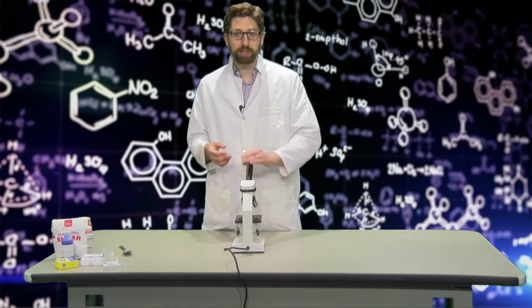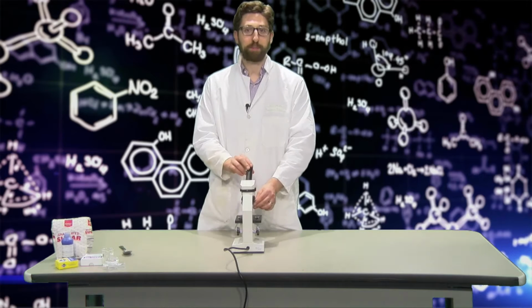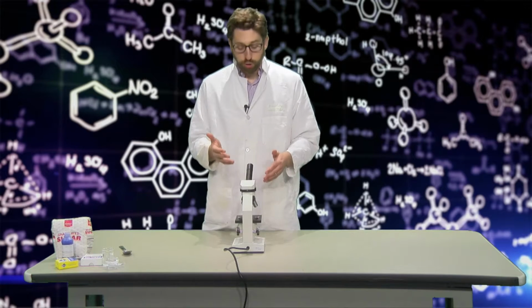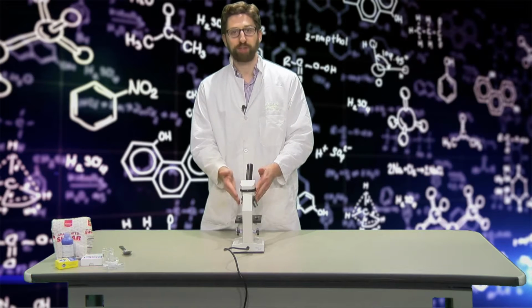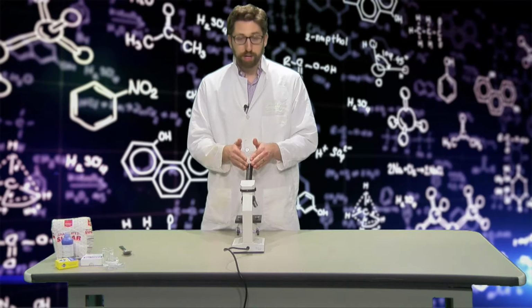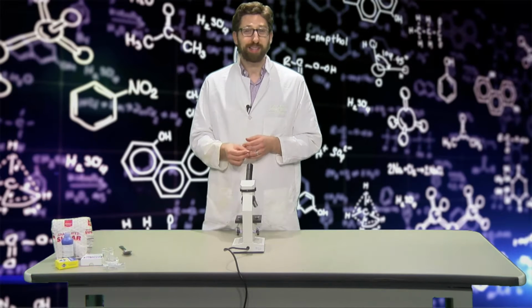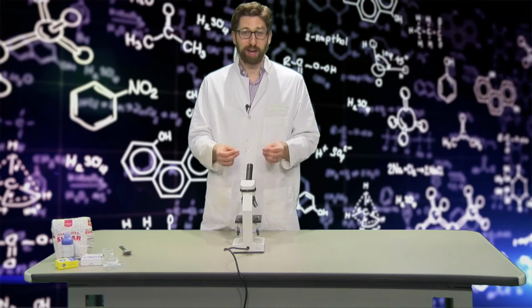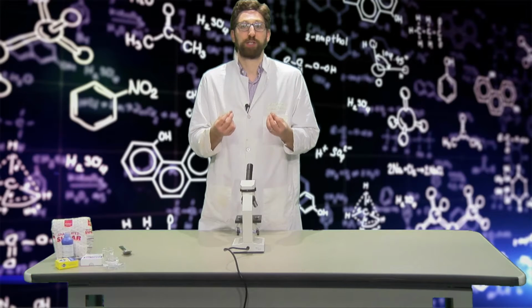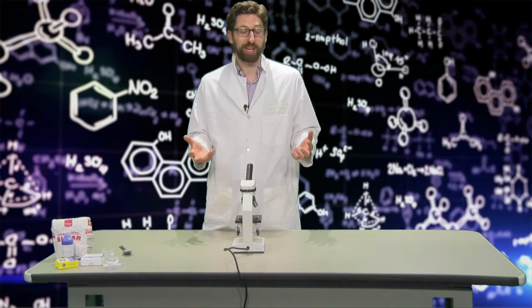Now the eyepiece, it has a magnifying power of 10 times. To get the magnifying power of the entire microscope, you multiply the power of the objective lens you're using times the power of the eyepiece. So actually the strongest this microscope gets is it will let me see things 400 times the size of what I could see with my eyes. 400 times larger. Not so small anymore.